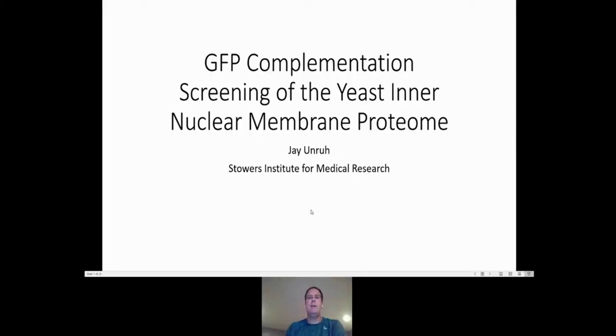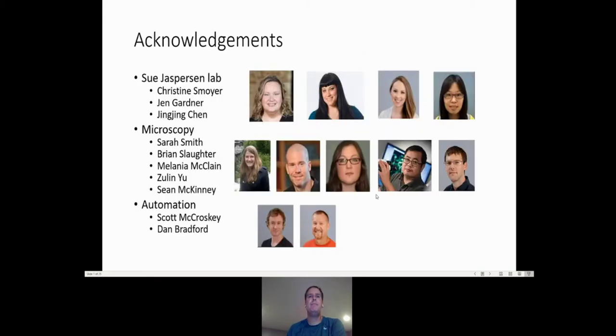Hi, everyone. I'd like to take the opportunity first to thank the organizers of the meeting and the organizers of this session for giving me a chance to speak here. I'm going to talk to you today about GFP complementation methods for screening the yeast inner nuclear membrane proteome.